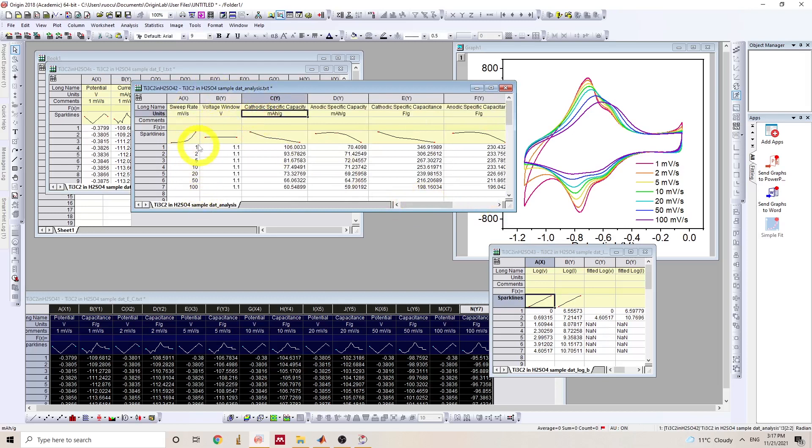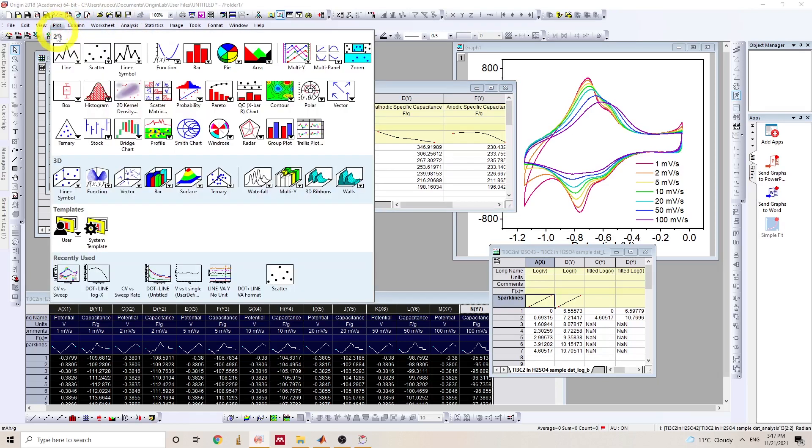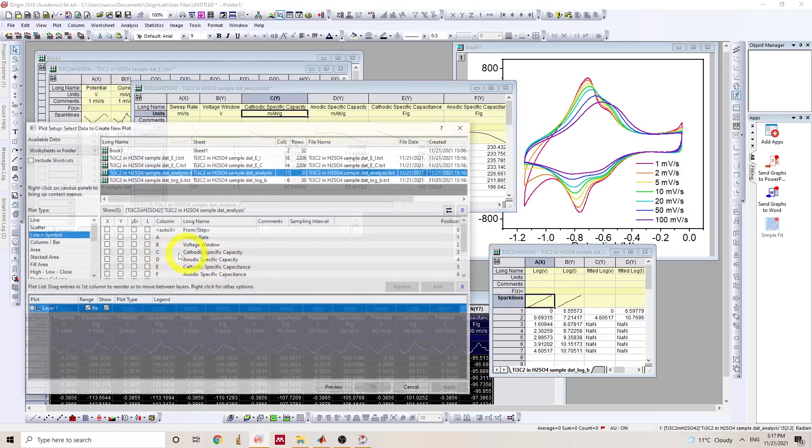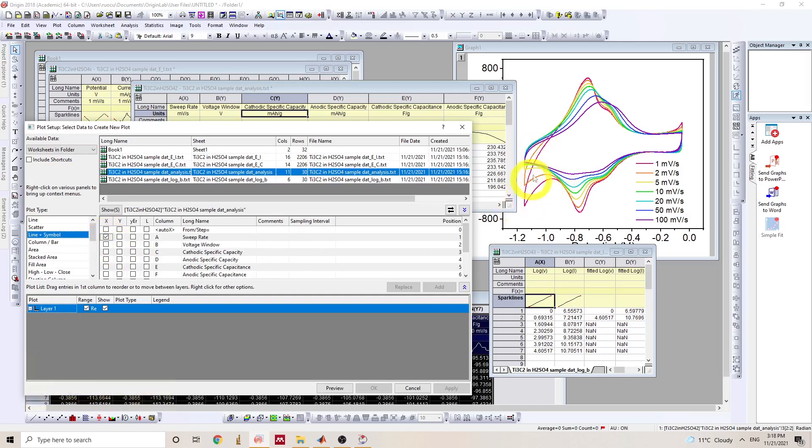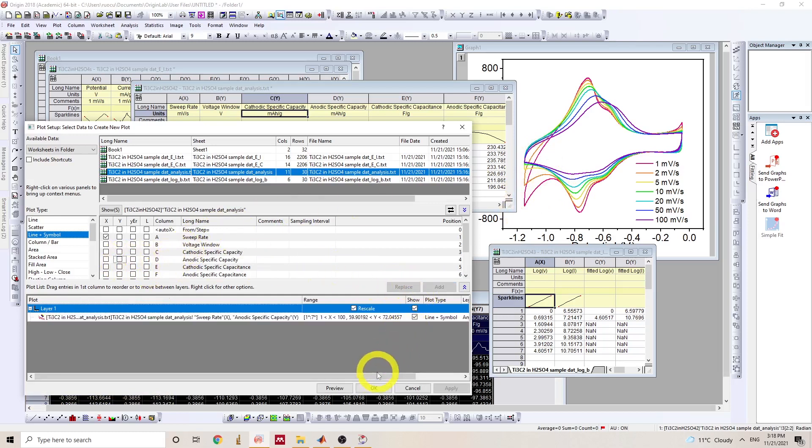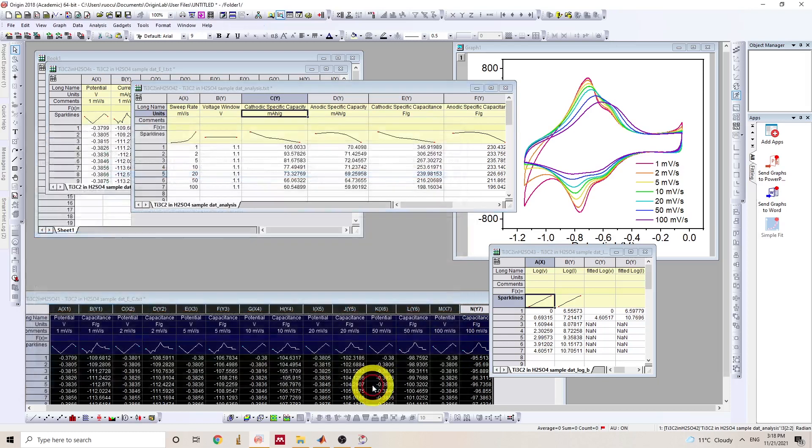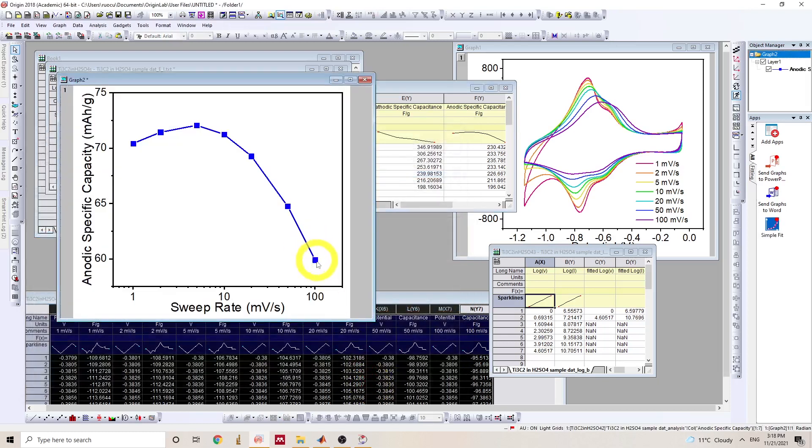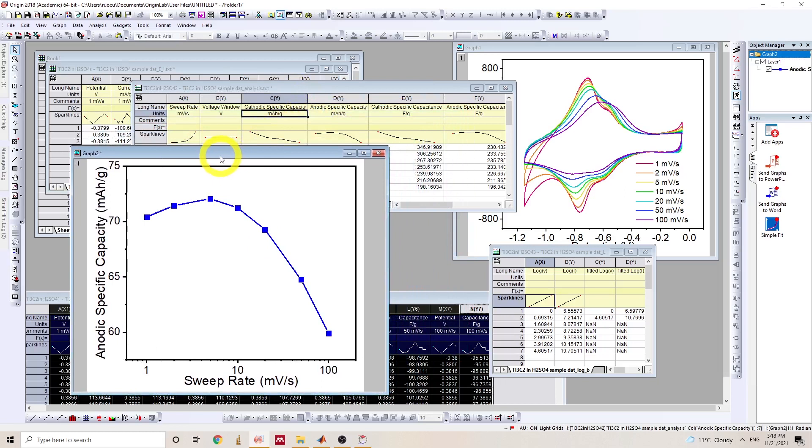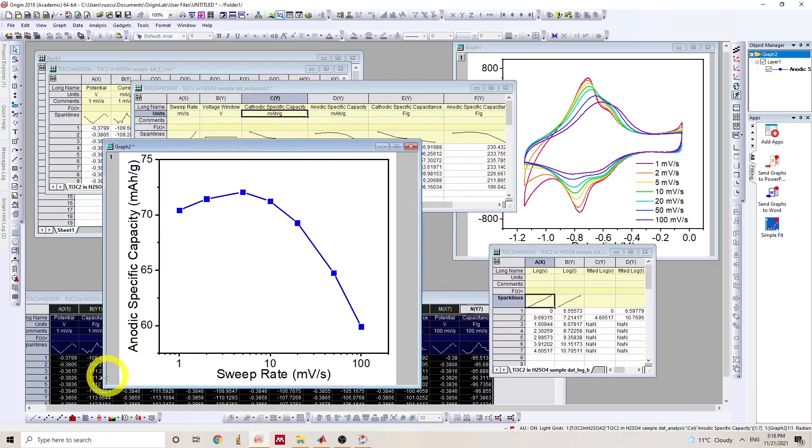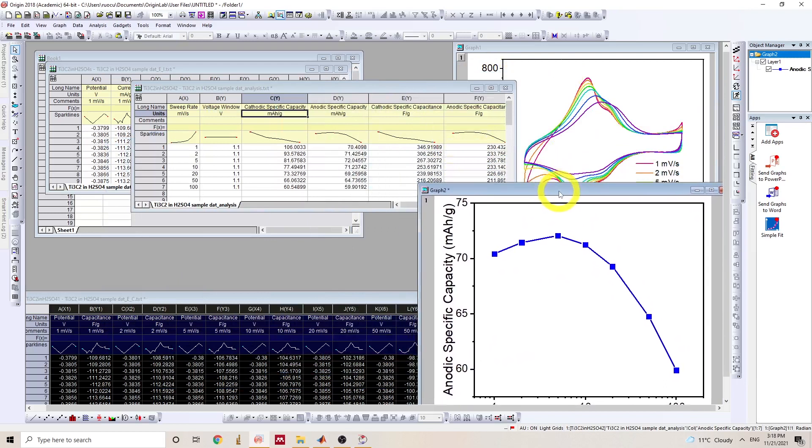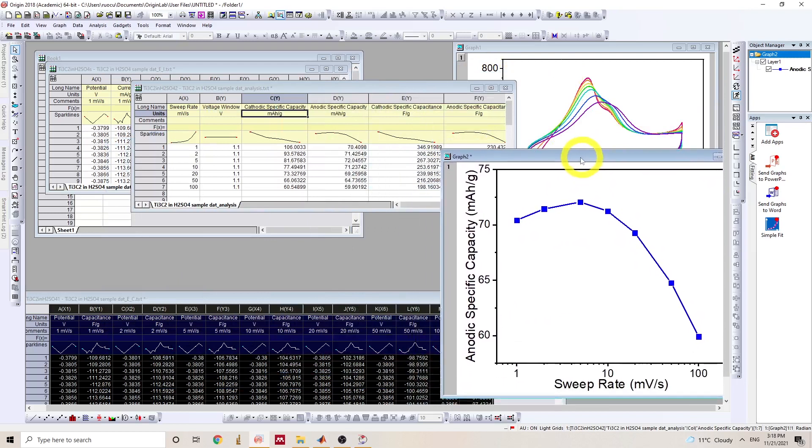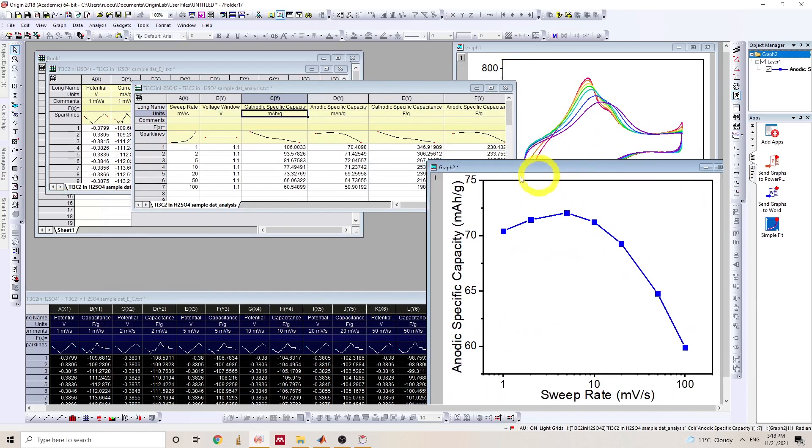So since we run from 1 to 10 to 100 millivolts per second across three magnitude, I like to use this log scale. Since the cathodic cycle has a lot of hydrogen evolution going on, I will just plot anodic specific capacity to be more accurate representation of the energy storage here. So you will see a graph like this showing the specific capacity as a function of sweep rate.